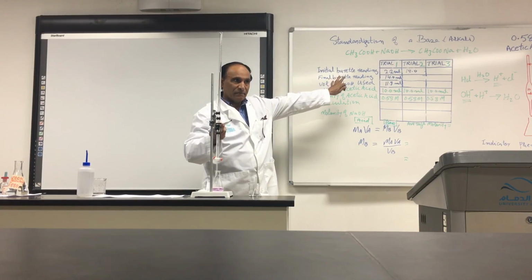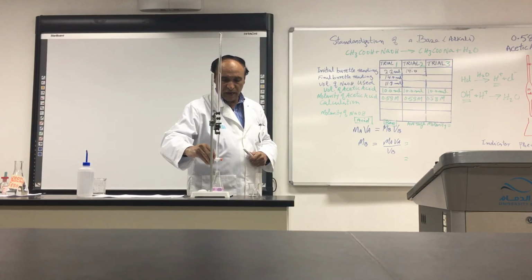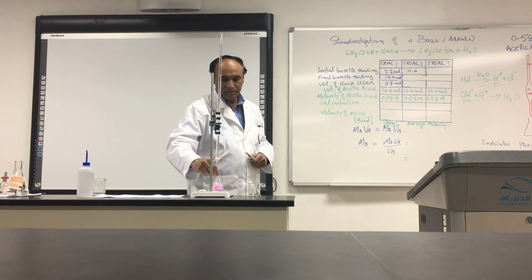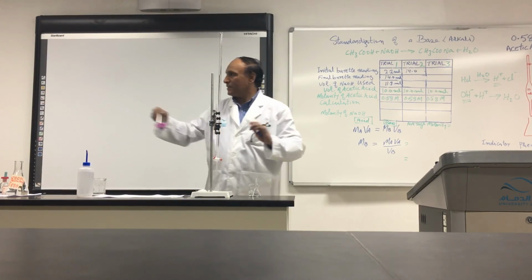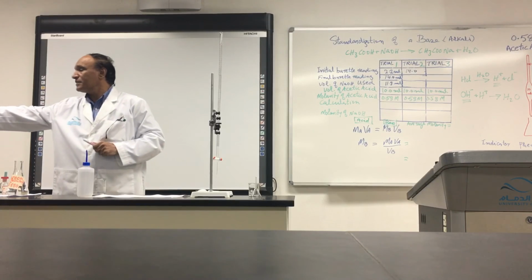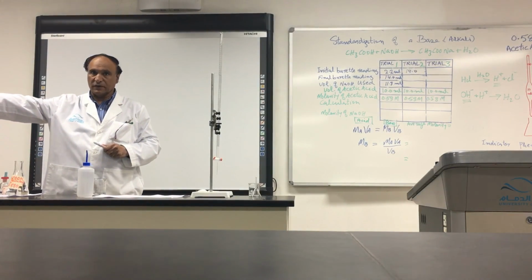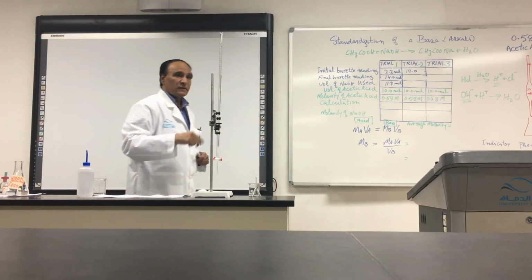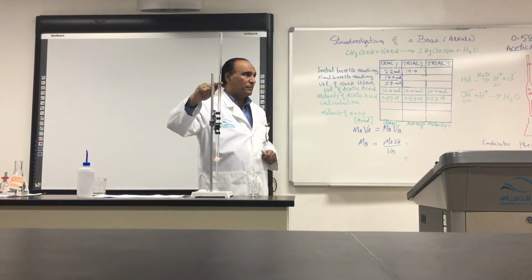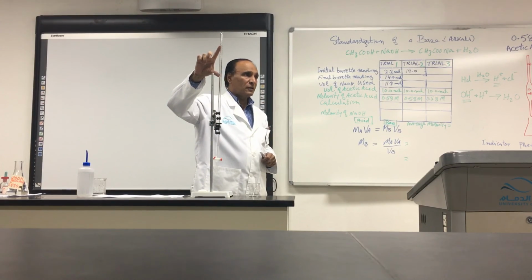But if you don't want to take 14, I want to show you, if you add more, it will become darker. Look, it will become darker. But the best is when it is light. Can you please wash the flask and give? No need to wash with the brush and the soap because it is just a liquid. So wash 2-3 times with the water and give me. So you can start from here. No need to fill it.